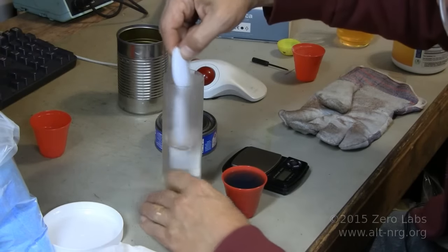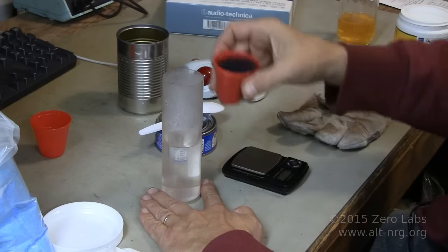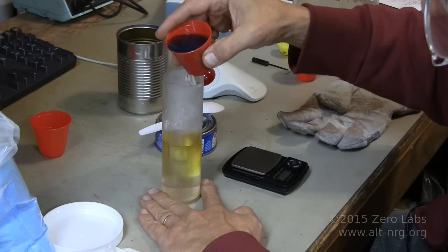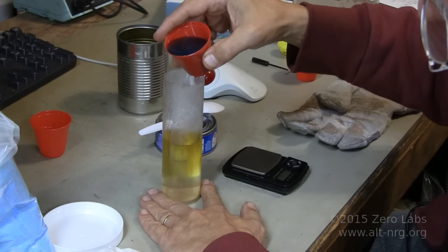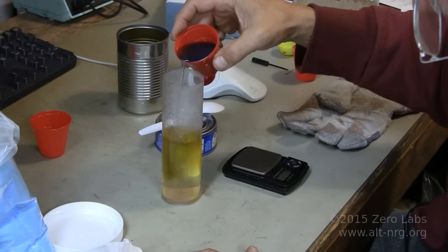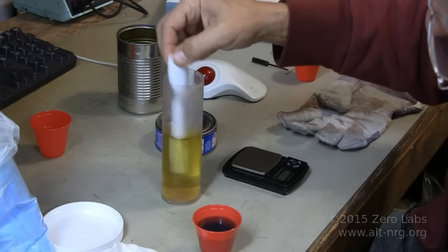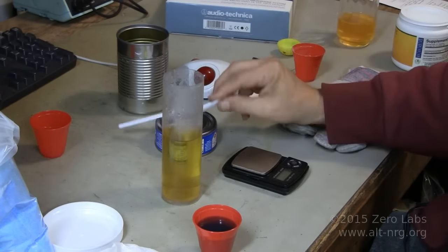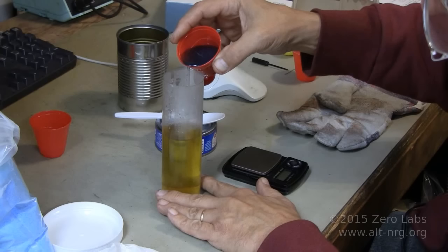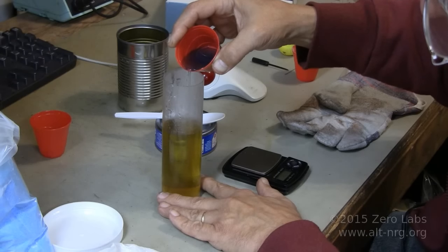All right, so I'm going to stir. Got it spinning around real nicely, and I'm going to slowly add. And there it goes. By doing this, copper is precipitating out of the copper sulfate. It is being converted into nanoparticle copper, which will sediment out to the bottom.